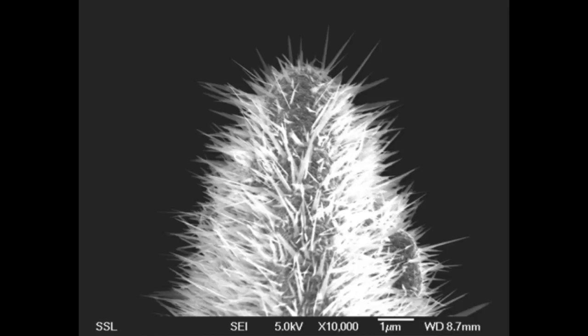From the image, we can see that 5 keV is the energy of the electron. Therefore, by multiplying by the mass of the electron, you can get the square of the momentum. From the momentum, we can calculate the wavelength by adopting the de Broglie equation, which gives a value of approximately 10 to the power minus 11 meters. Resolution depends on lambda, and therefore having a lower lambda leads to a better resolution. A typical SEM image has a resolution of approximately 1 nanometer, and that is its maximum. This is higher than the de Broglie wavelength calculated, which is 2 orders of magnitude lower.